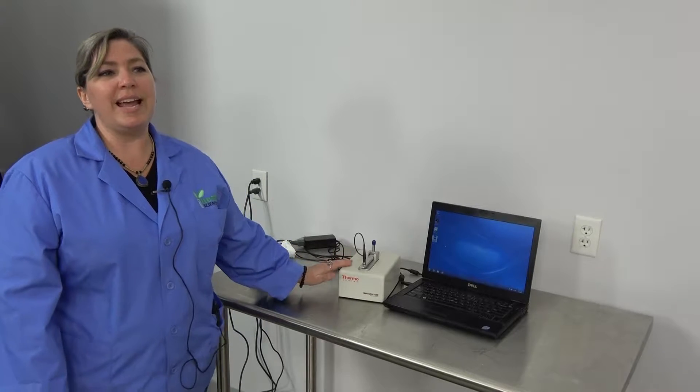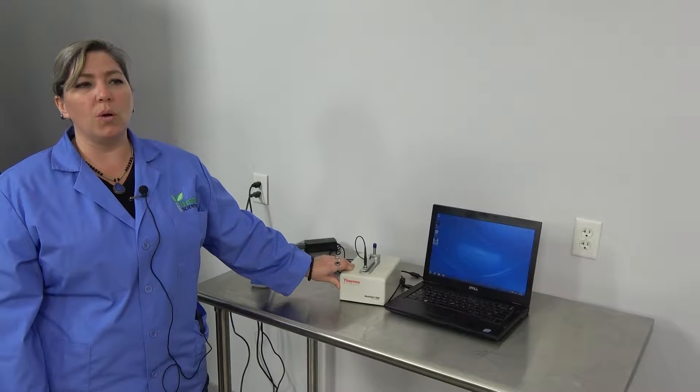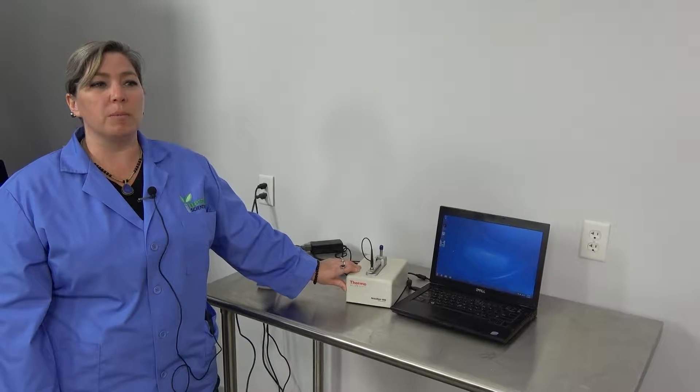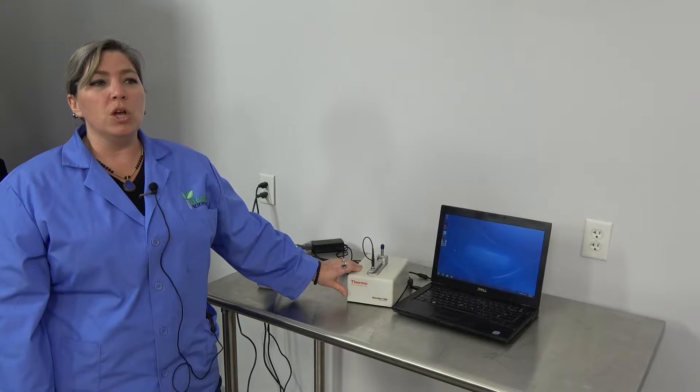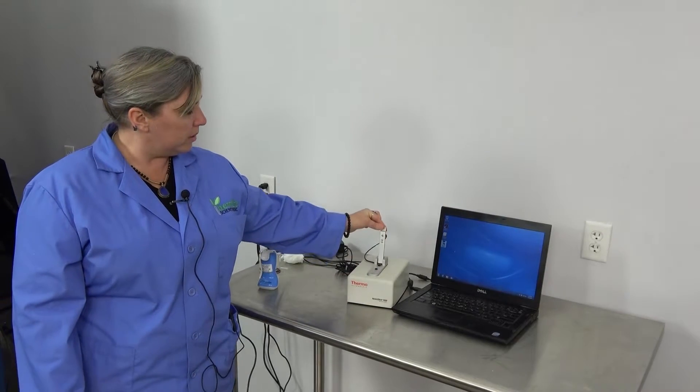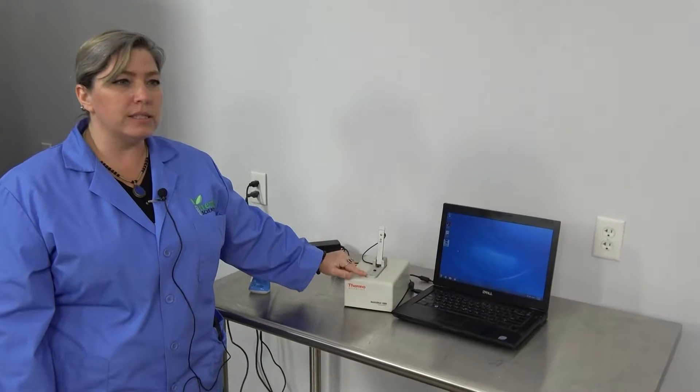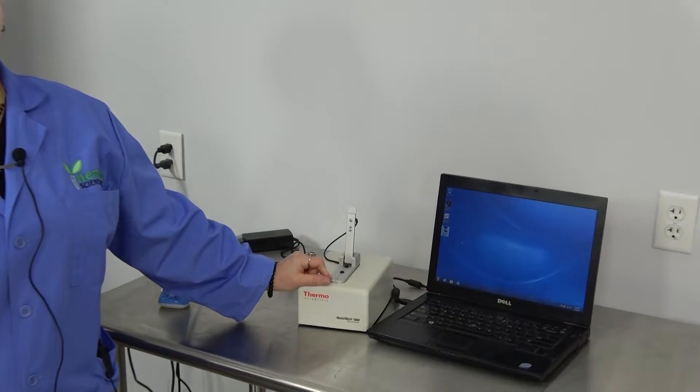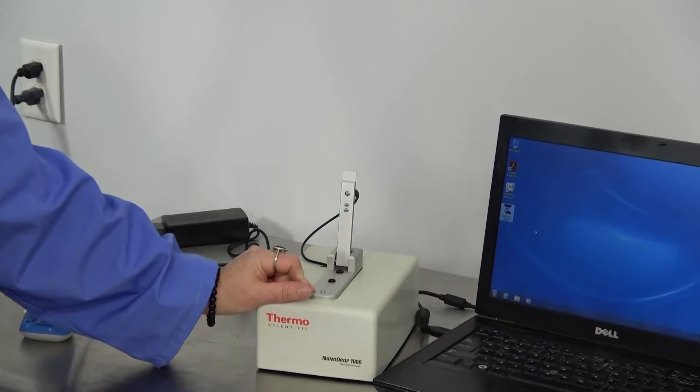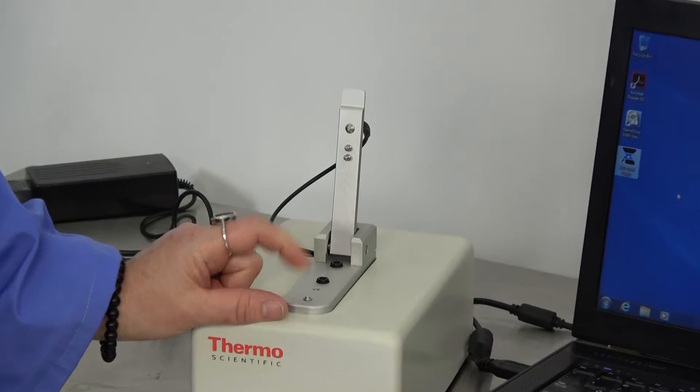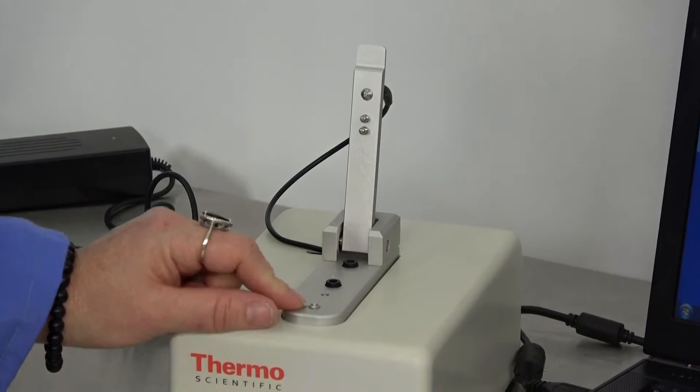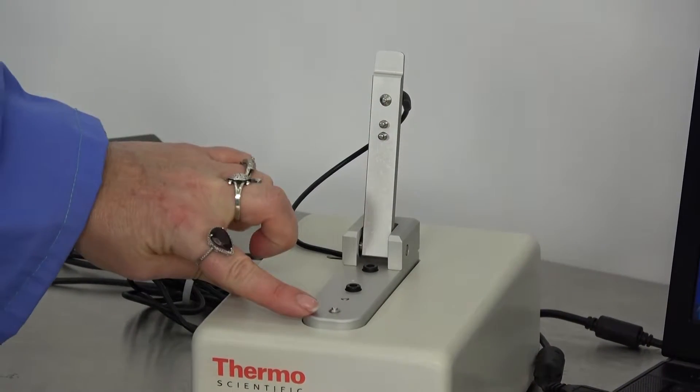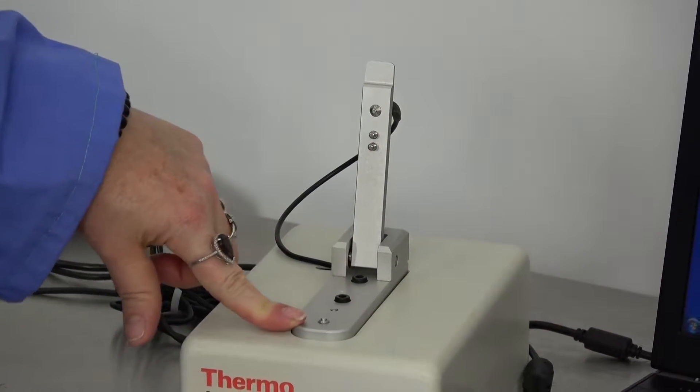It uses inherent surface tension of liquids to hold and measure microvolume samples between two optic pedestals, seen with these little dots, without the use of cuvettes or capillary tubes. The sample creates a column by clinging to both the top and the bottom metal pedestals.